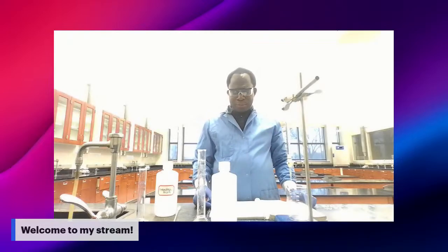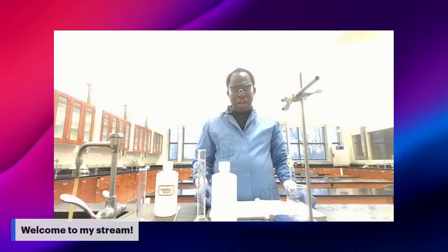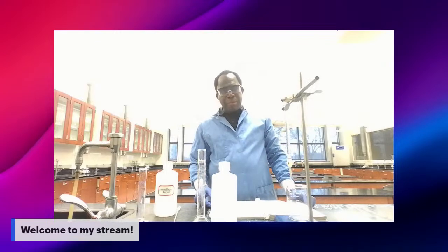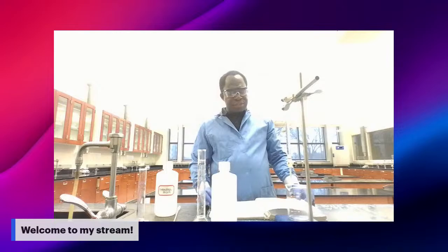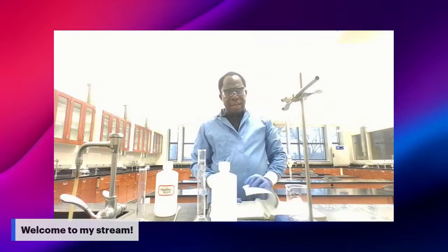Our lab today, and we are going to be performing our experiment number 7, which is identifying a weak acid by the determination of its Ka.